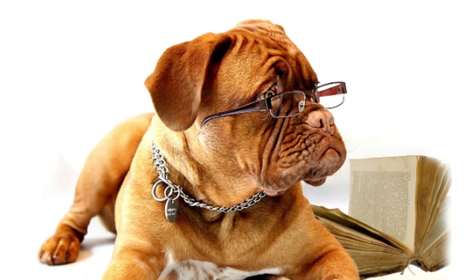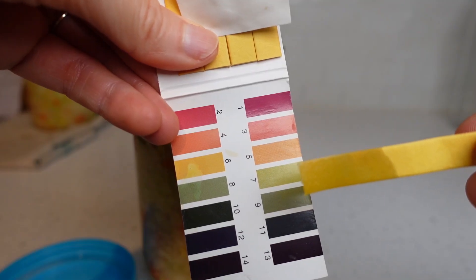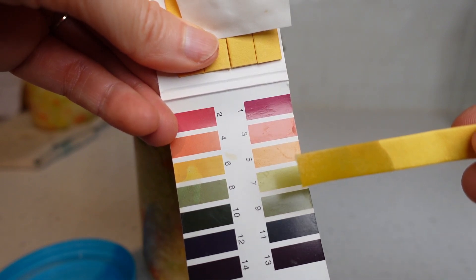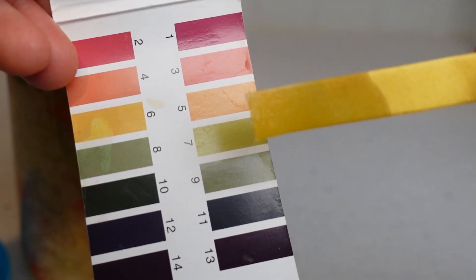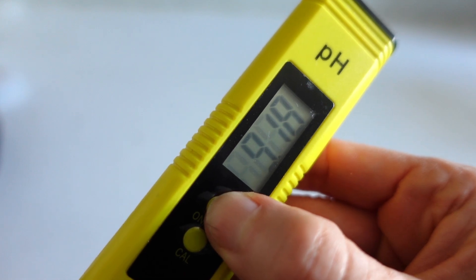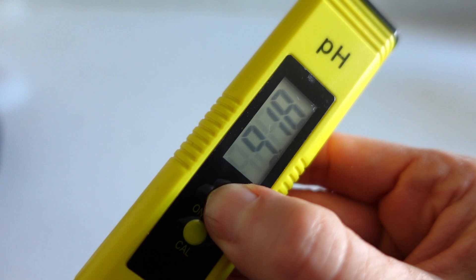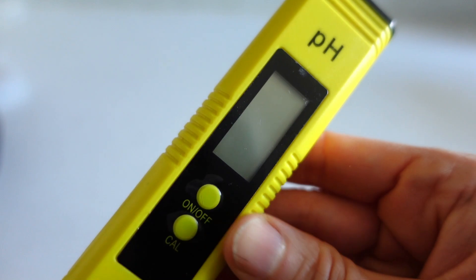For those who have issues in the eyesight department, display of the pH reading matters. With paper test strips, color matching can be challenging if you don't see colors well or at all in the case of color blindness. Even with good color vision, the result of the pH test color is sometimes an in-between shade that doesn't exactly match the color code selections. The basic meter has a digital display that removes the guessing out of color matching — that's the number one reason I switched from paper test strips to a digital meter. The basic meter is not backlit, which is a deal-breaker for my 81-year-old mother who has poor eyesight, but typically isn't a problem for most people.